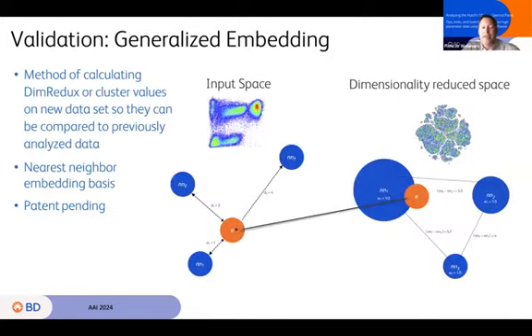Last slide, promise? Okay, I wanted to point out that all these tools that I used, to take them forward, to do something with them, if you identify something really interesting that you want to make the bedrock of your next hypothesis or your discovery pipeline, you need something that takes the results from clustering or dimensional reduction, whatever you've done on one experiment, and allows you to propagate them to the next experiment.